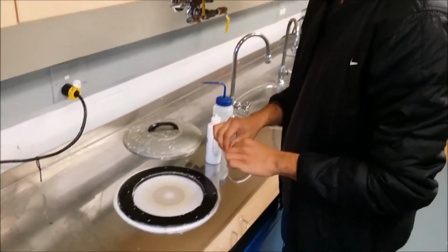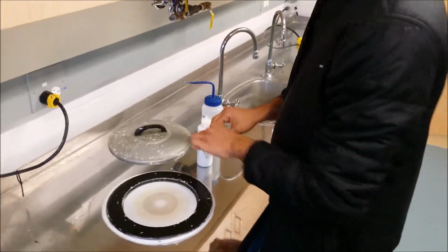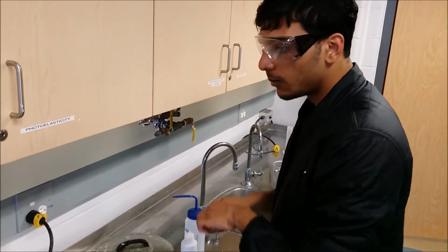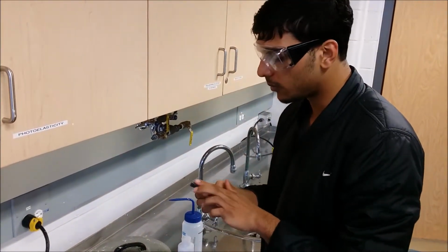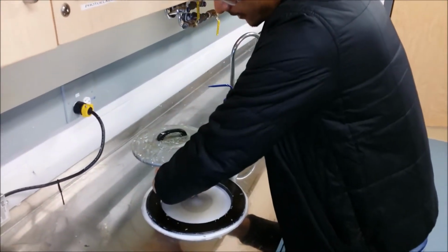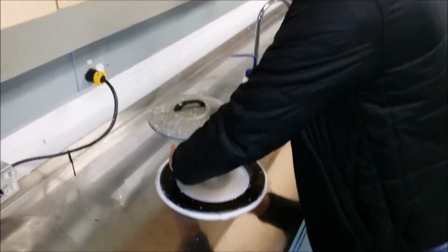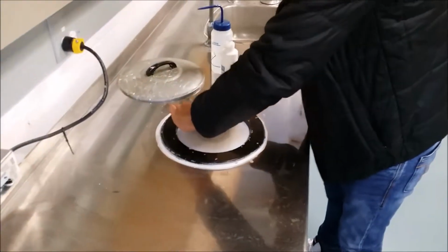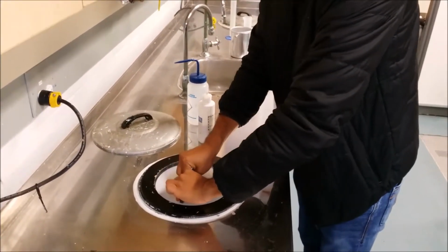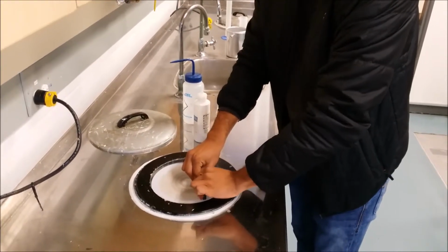As the wheel is moving clockwise, we need to hold our piece and go in the anti-clockwise direction so we can have more friction and more polishing of the surface. Applying uniform pressure with both hands on both sides, slowly moving it in the counterclockwise direction.